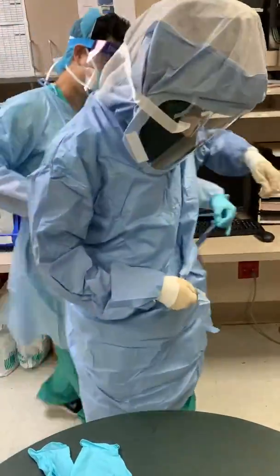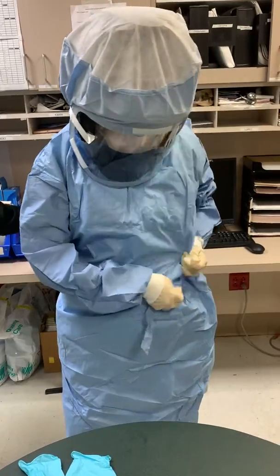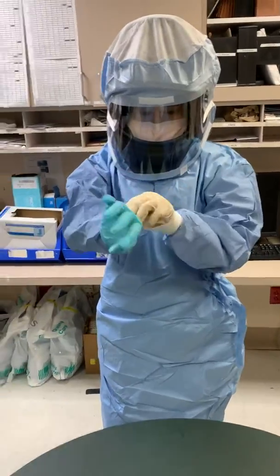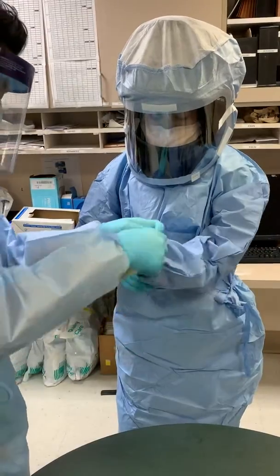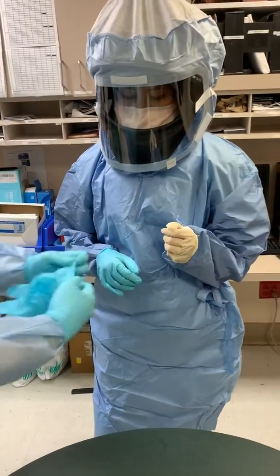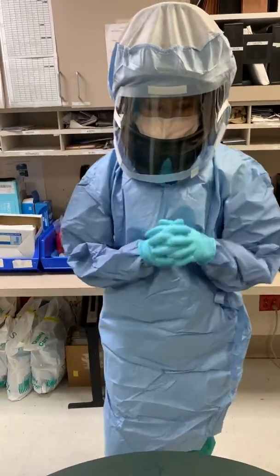The last step is putting on regular gloves. Now you are ready to go save a life.